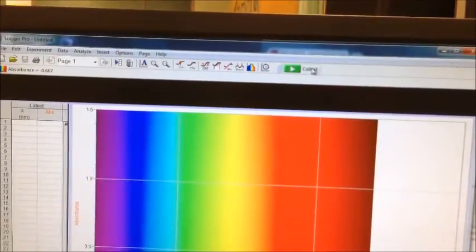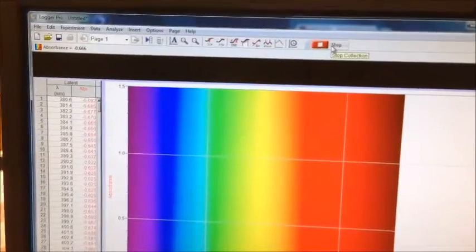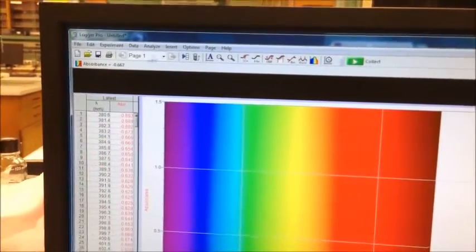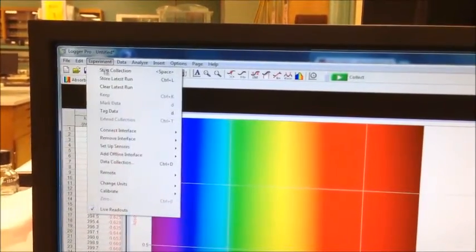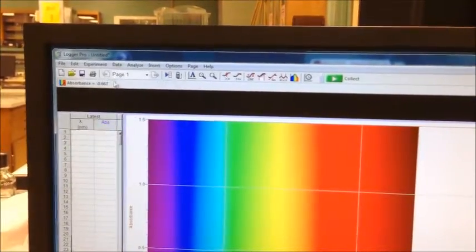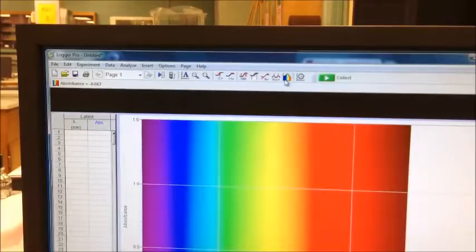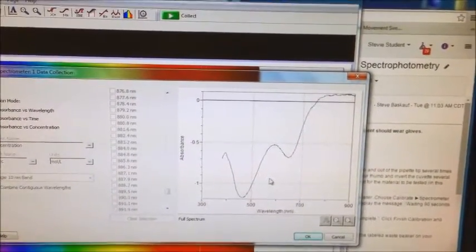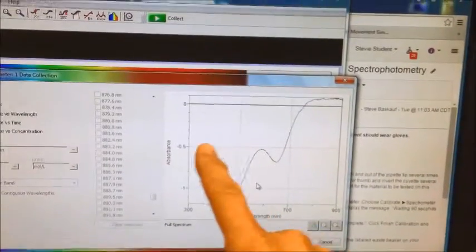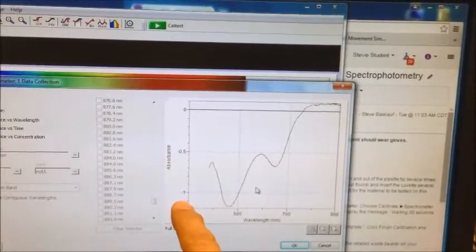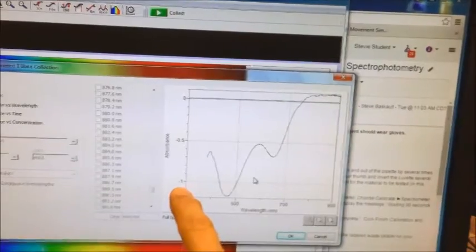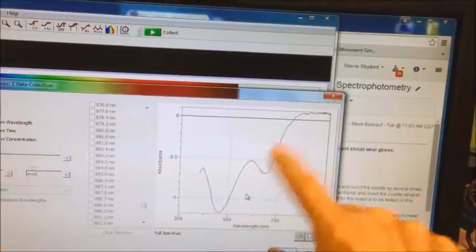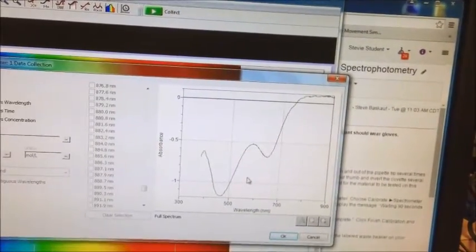I'm going to tell it to collect. It's collected data. I will tell it to stop. Store latest run. Let's see what we have. Interestingly enough, almost every value is negative, and it's not in the hundredths place like the last experiment I did. Everything is significantly negative. Why is that the case?